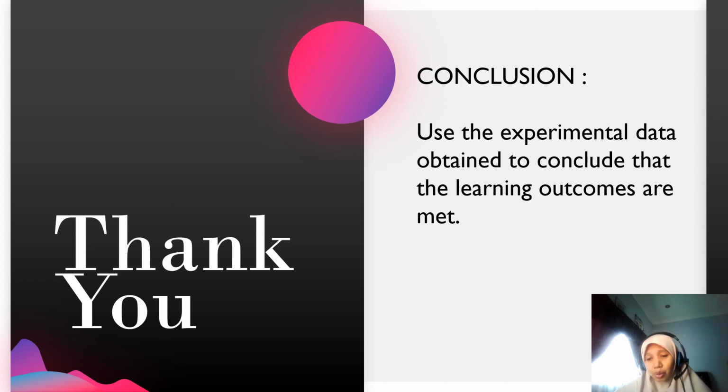So the conclusion for that is: the molarity of hydrochloric acid solution determined was 0.1975 molar. Maybe that's it. Don't add extra information to your conclusion. Alright, so I think that should be enough for you to complete your report. All the best.